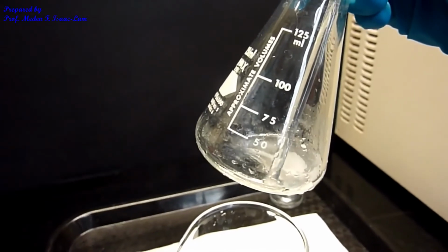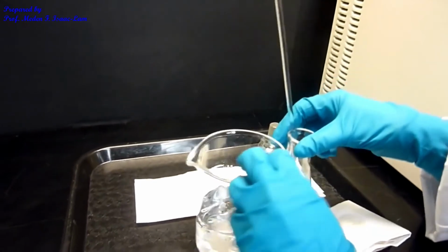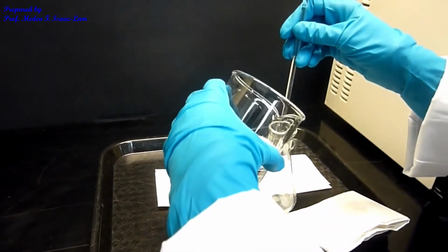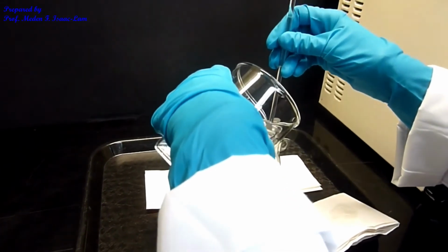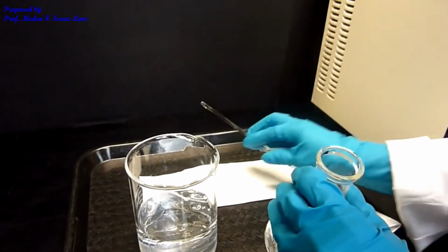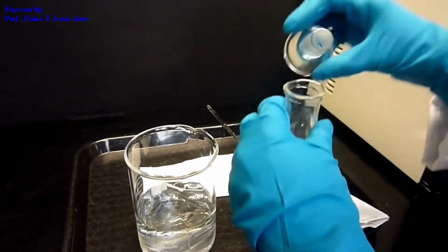So now I'm going to microwave it for another minute, but I'm gonna rinse it a little bit with water. The stirring rod, okay? And then I'm now going to microwave it for another minute.